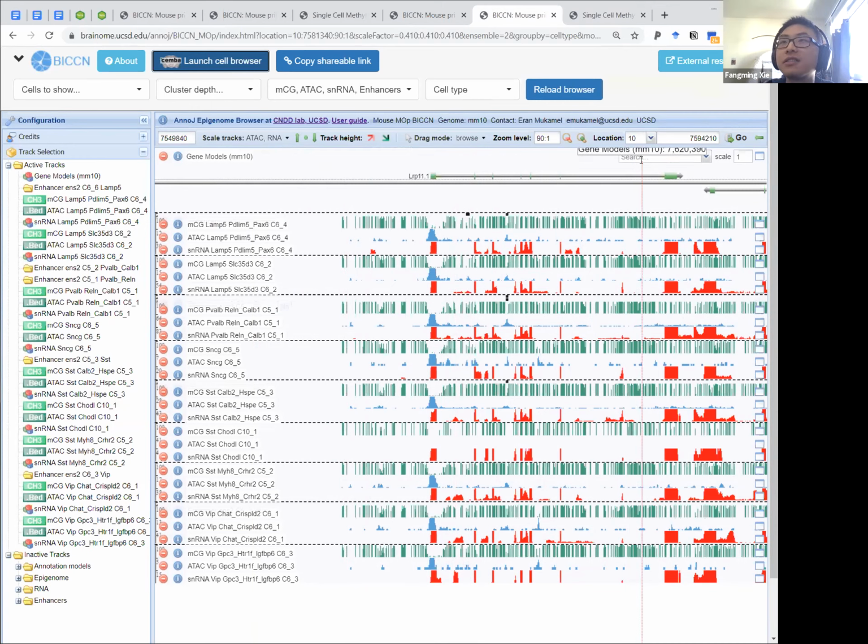One fun thing to do is to have everyone name your favorite gene, and we can just all look at it together. Okay. Yeah, if you have further questions, feel free to contact us. I mean, somebody put in a gene there. I see. Yeah. Okay. Let's go RFX3.